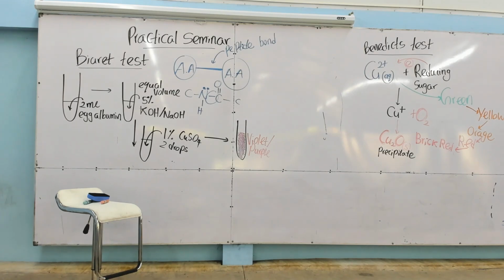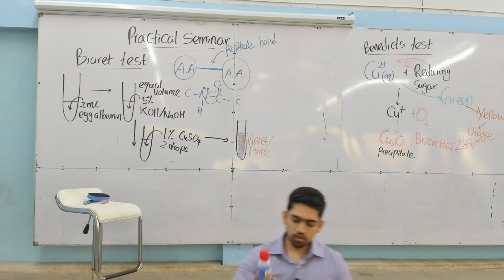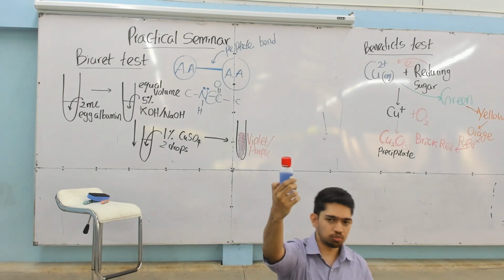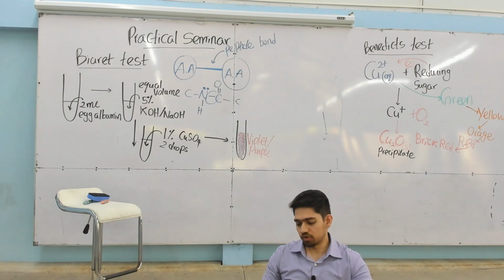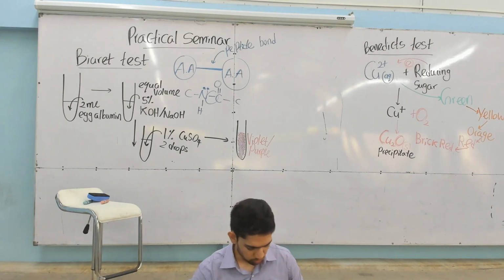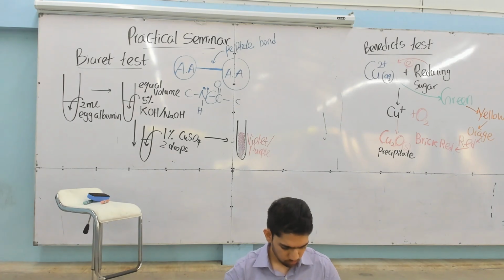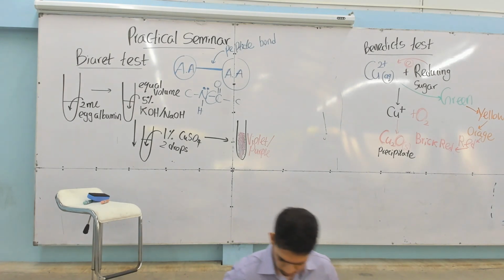Biuret reagent, as I told you, we don't need to prepare from KOH and NaOH. You can have a direct, pre-made Biuret reagent for the detection of peptide bonds. We use this for industrial purposes, such as food processing. So we don't need any heating or anything. The heating experiments are sort of done. For fun, we can do a few more, like fructose.